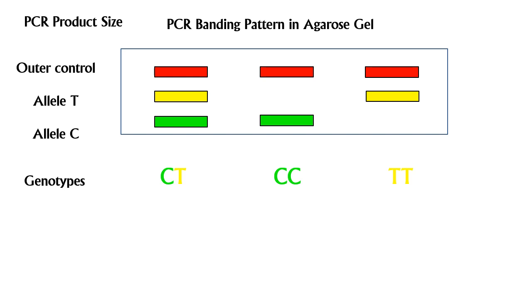It means that the DNA isolated from this individual has both the T and C allele, meaning that this individual is heterozygous. One chromosome of this individual has a T allele in the microRNA 585 gene, and the other chromosome contains the microRNA 585 gene having the C allele. So this is a heterozygous individual having the CT alleles.